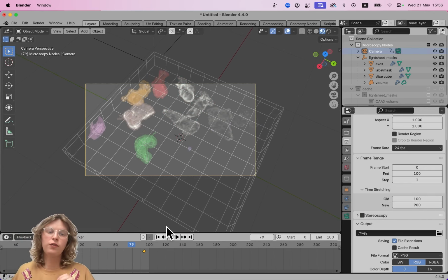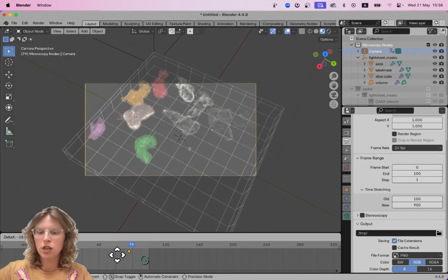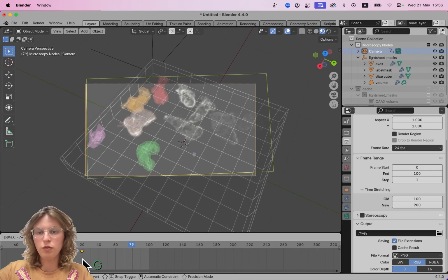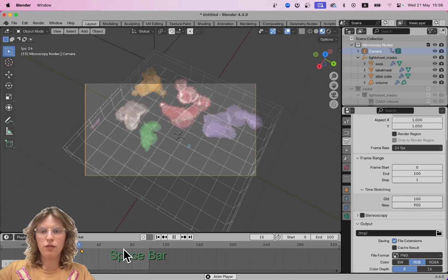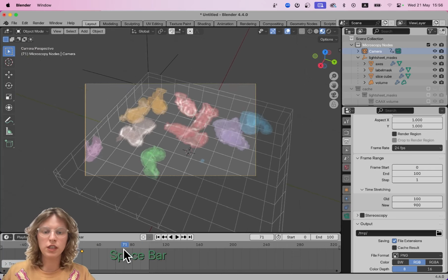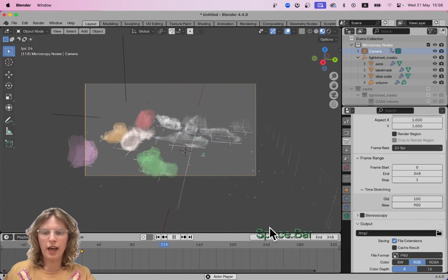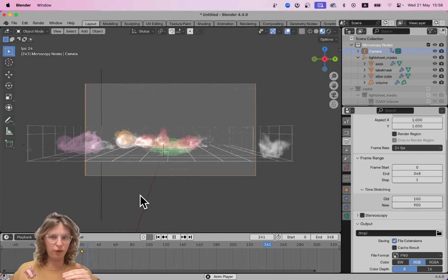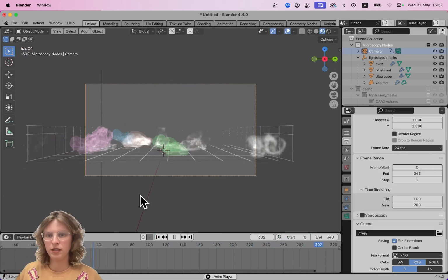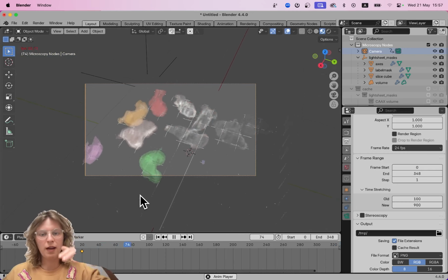Our keyframes are also affected by the time stretching. So while this does add more frames of interpolation, you would also still need to move your keyframes. So you can actually move your keyframes with G. And we now have, for the first sequence of time, do a little bit longer, we have our frames moving slower than our actual time because we've stretched the time. So now we can see all of our cells moving slowly while our camera smoothly moves down.